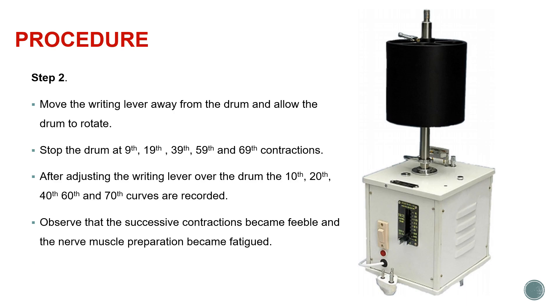Now coming to the procedure, we are moving the writing lever away from the drum and allowing the drum to rotate. We are giving the stimulus and the muscle is contracting, but the writing lever is not touching the drum, so we are not recording all the contractions. By the time we have finished the ninth contraction, we stop the drum.